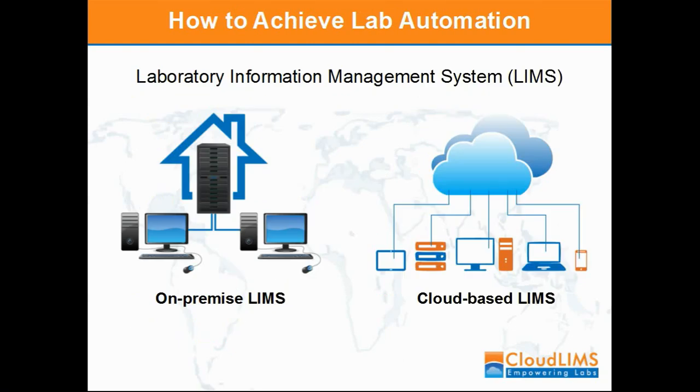Informatics facilitates lab automation with the development of bioinformatics tools for managing and processing lab data. LIMS, or Lab Information Management System, is a software that allows you to effectively manage lab data, testing workflows, and data tracking to improve operational efficiency. Using a LIMS for your lab not only automates workflows but also integrates instruments for data exchange. There are several reliable LIMS products in the market. The cloud-based LIMS is gaining prominence over the traditional on-premise tools due to its service advantages.